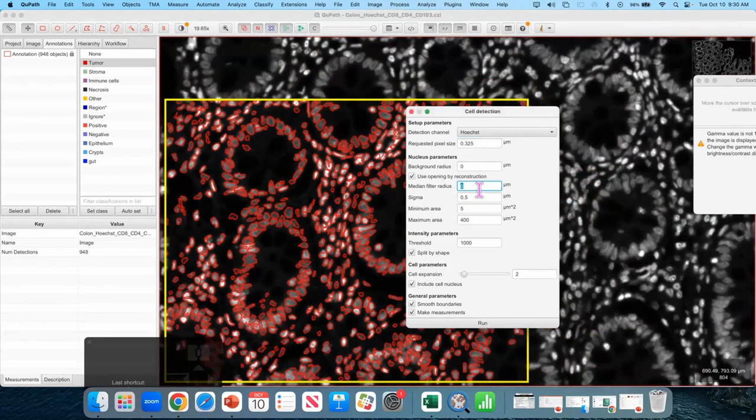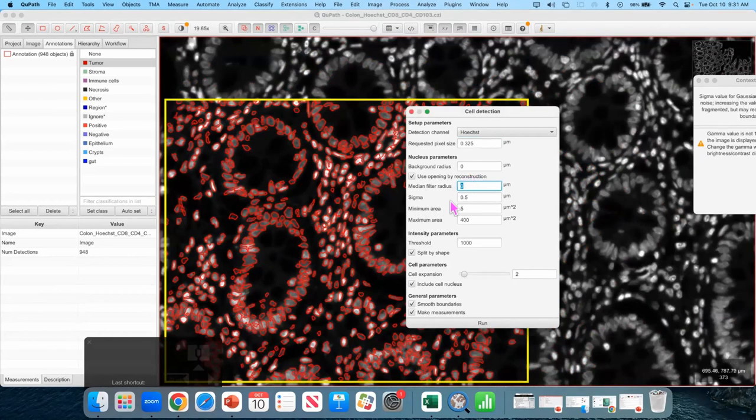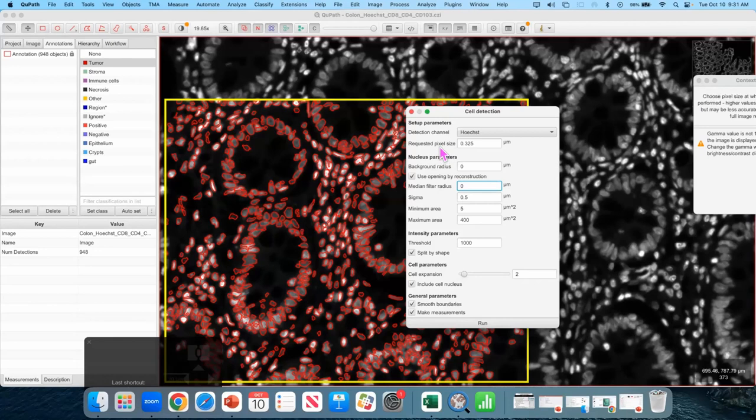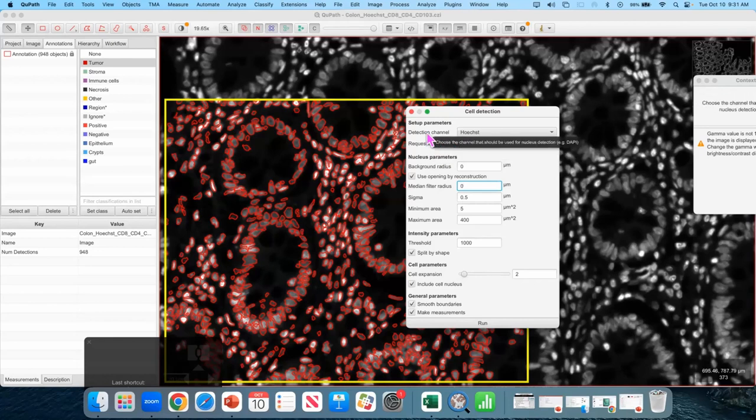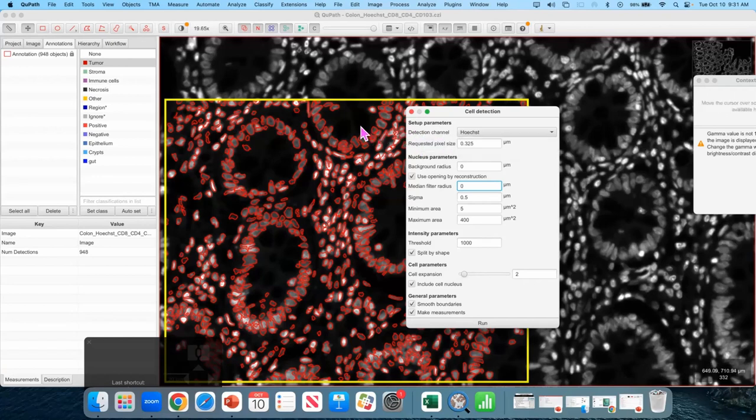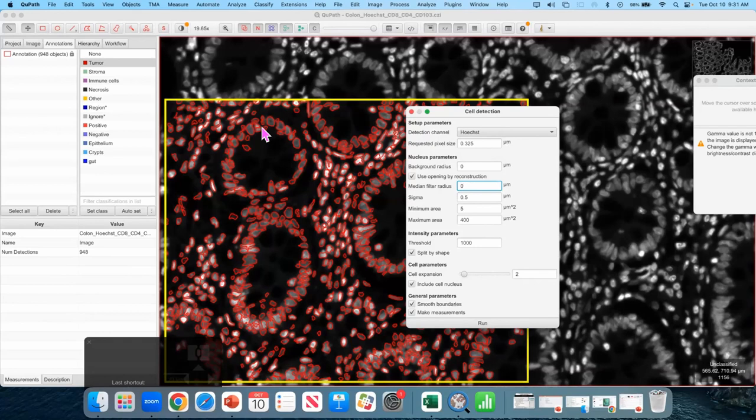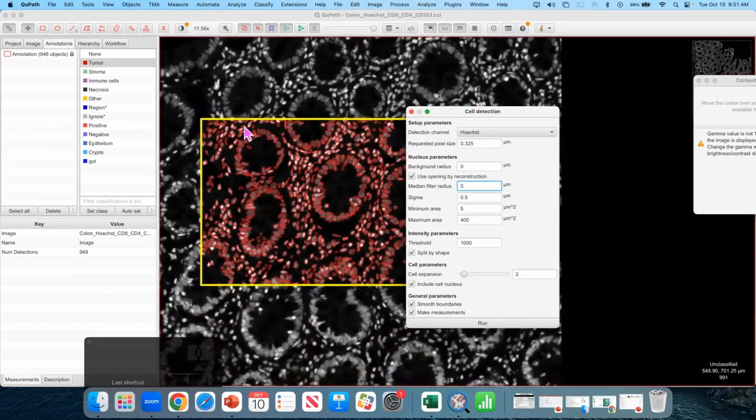Yeah so it's actually taking the minimum value so you can think of it as like as long as there is a background pixel within the distance of every pixel and the place where that is the hardest is going to be right at the middle of the cluster. So based upon the size of the nucleus or the size of the cluster you've got you just need there to be a background pixel within that. So what I haven't really talked about at all is this median filter radius. This applies a median filter to your image before doing any of the rest of the steps probably after background detection but next. In bright field images you almost never need it. Your image has so much signal that there just isn't like shot noise. In really dim fluorescence images where the background variance is a meaningful issue in your life then applying this filter can just clean up everything. It's a shot noise filter.